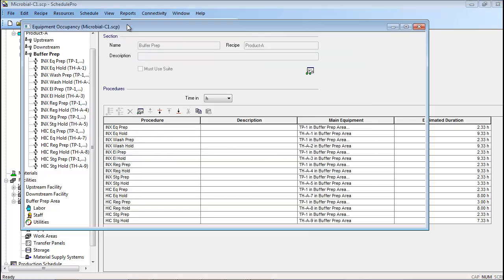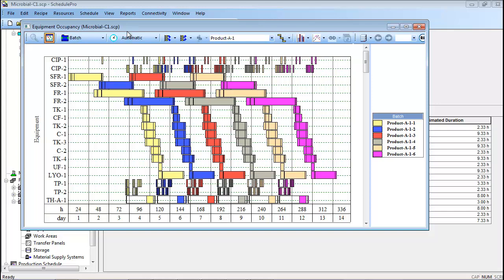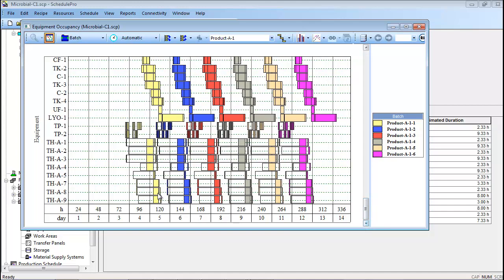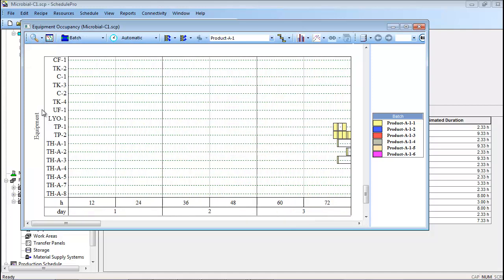The EOC associated with case C1 is shown here. The reason that only two buffer prep tanks are used is that the buffer preparation activities are relatively quick, so reusing these tanks does not create scheduling bottlenecks. Unlike the buffer prep procedures, each of the buffer holding procedures has its own dedicated holding tank, THA1, THA2, etc. Furthermore, notice that the buffer hold tanks are typically idle for extended time periods between their receive buffer operations and their use buffer operations. This can be seen clearly in a zoomed-in view of the EOC.